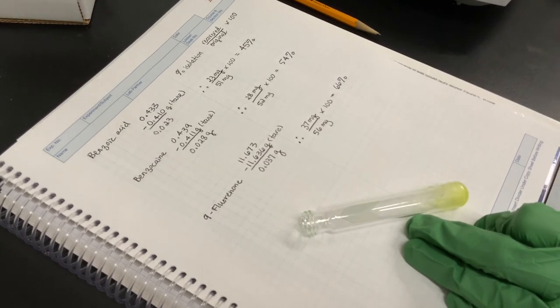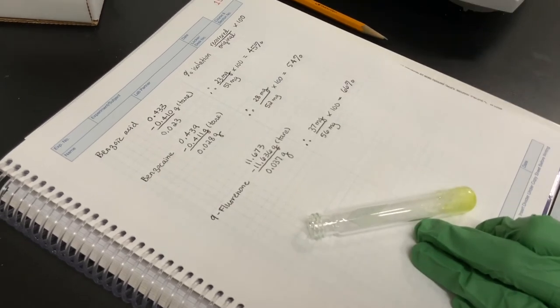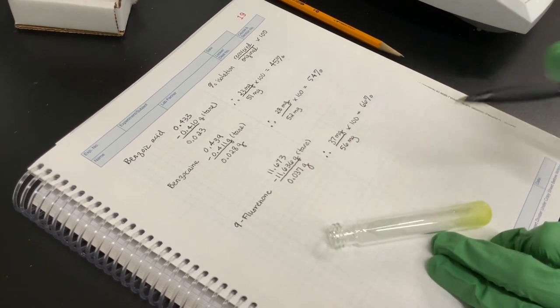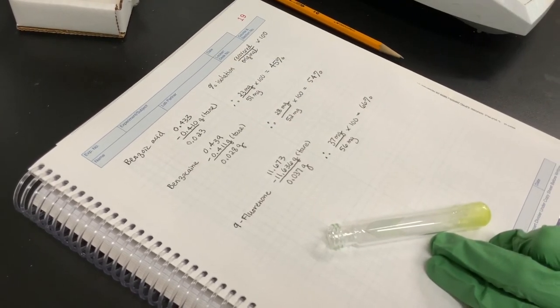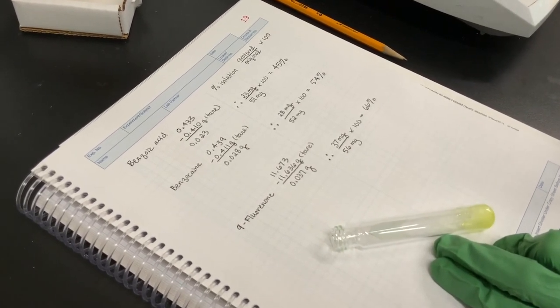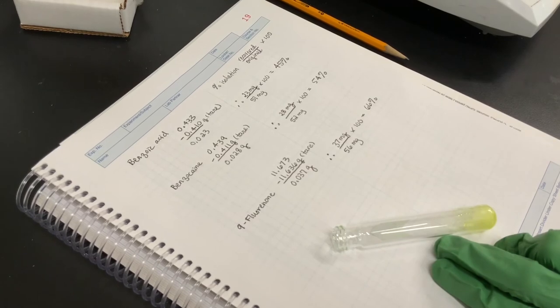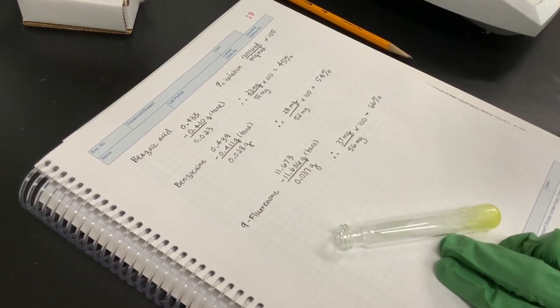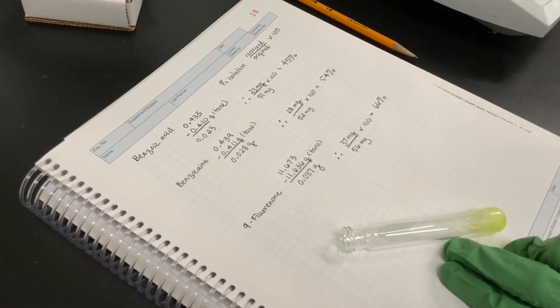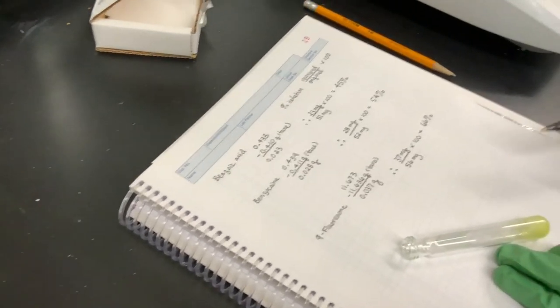And then for benzoic acid and benzocaine, again, we could say that we lost the material due to the fact that benzocaine is partially soluble in water, and maybe when we rinsed it, either one of these with water, we took some of it away that we were able to filter. And then, of course, the amount that we isolated wasn't close to the original mass because some of it was left stuck to the sides of the walls of the Erlenmeyer flasks that we had chilled, and also stuck to the porcelain of the Hirsch funnel and what have you. But nonetheless, we did a pretty decent job.